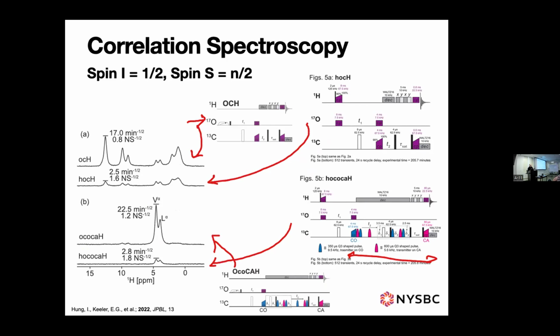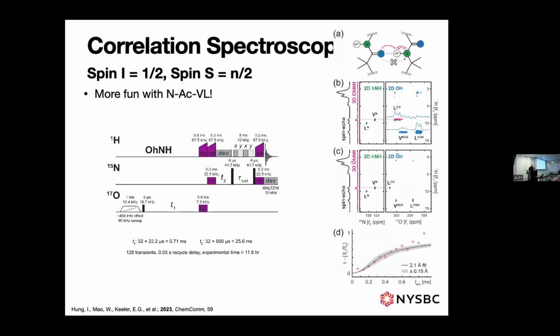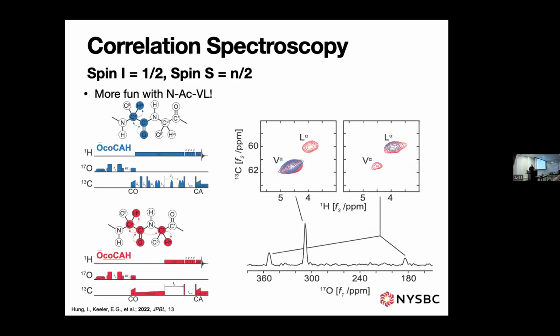Yeah, it's frequency selective homonuclear pulses happening. I don't remember exactly what name they used, but as I said, we're in the regime where things are looking like solution. I can't recall if what Ivan did was even dipolar based, or whether they used a J-based experiment, because they're spinning at 60 kilohertz, so you can do the J-based experiment, so it might even just be a solution-type experiment.